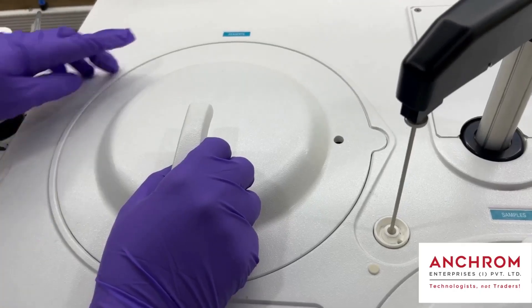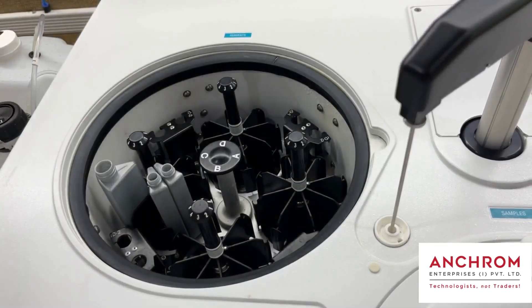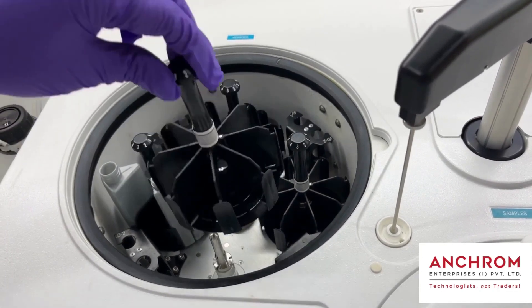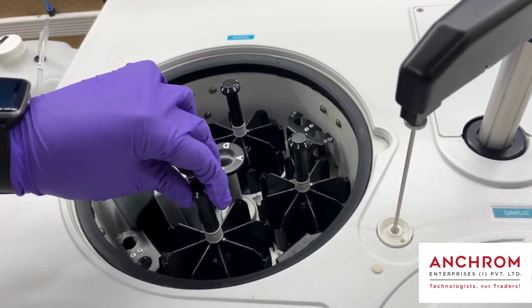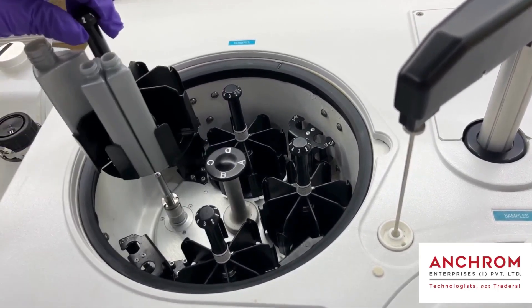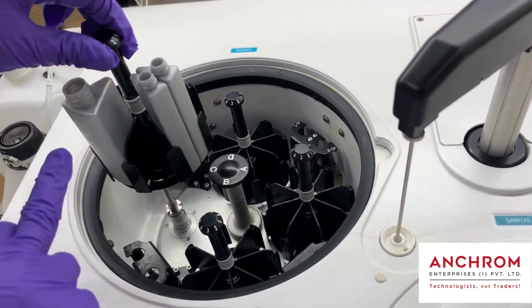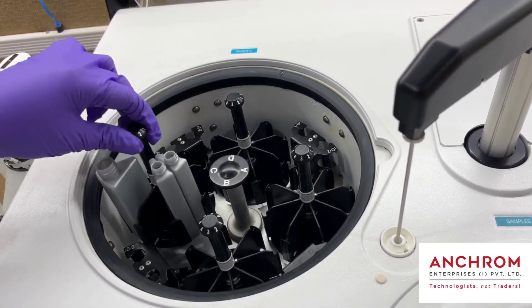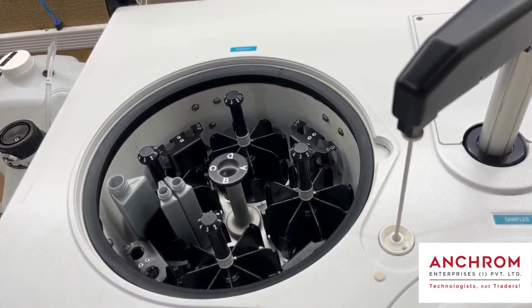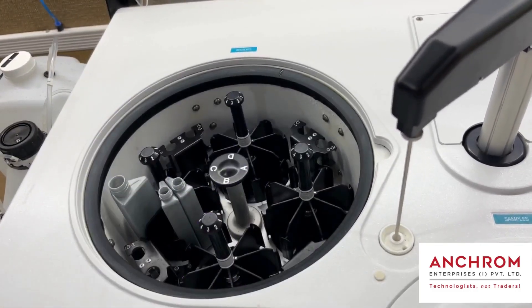You can see here a dedicated compartment for reagents. This is the Reagent Rack where you can load your reagents. Reagent storage containers come in two sizes: 25 ml and 50 ml. If you are using 25 ml bottles, you can store 72 reagents at a time.